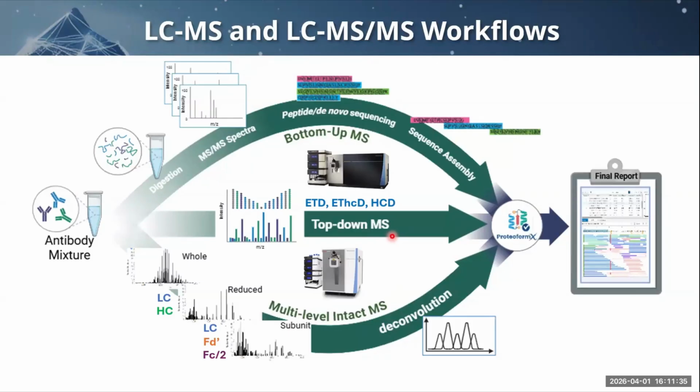To give you an idea of the workflows that I'm going to present, they are LC-MS and LC-MS/MS workflows, and they include bottom-up, top-down, and intact mass analysis. Let me walk you through each one. I should mention that all these experiments were done on high-resolution instruments, the Orbitrap Fusion Lumos and Orbitrap Exploris, with various fragmentation techniques, including ETD, EThcD, and HCD.